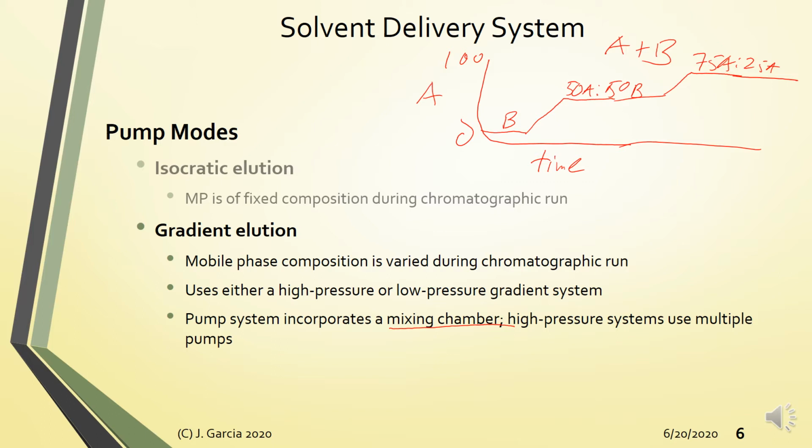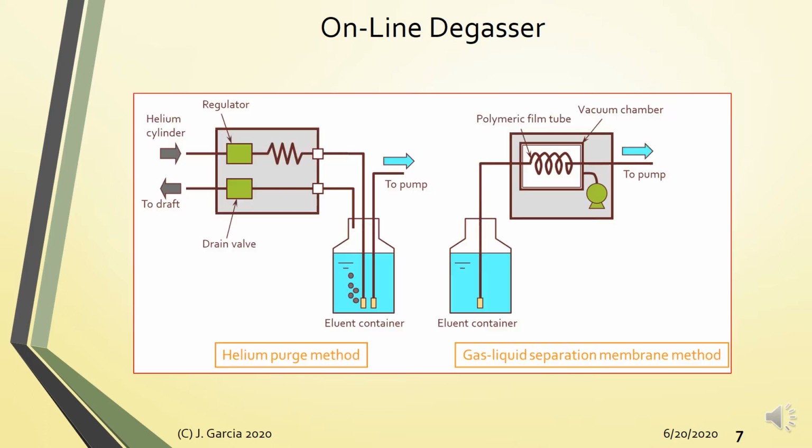So these two are actually analogous nga doon sa temperature settings, no, ng gas chromatography, no. So isocratic elution, if you remember, is analogous to your isothermal run, whereas your gradient elution is analogous to your temperature programming, no? So this is one way, no, of remembering things, no, by remembering the analogous pairs, no, of concepts. Marami yan sa chemistry.